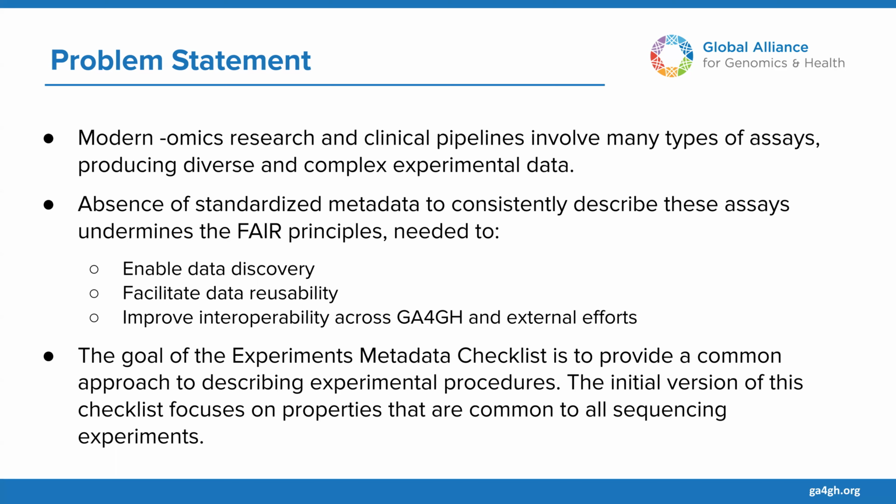So the problem is that the absence of standardized metadata to consistently describe the differences between these assays undermines the FAIR principles needed to discover the data, to facilitate data reusability. For instance, let's say I obtain two data sets from two sources, and I'm not exactly sure about the experimental conditions in which these were run. It will be difficult for me to assess how comparable or how usable together they are.